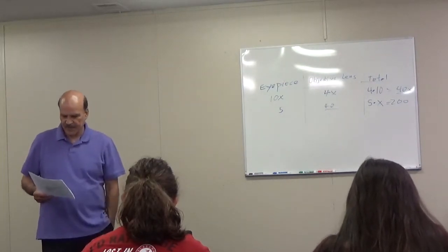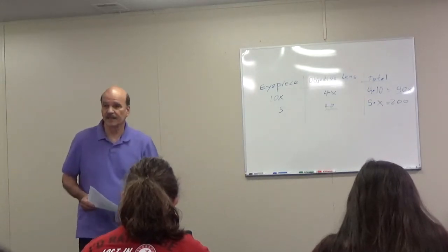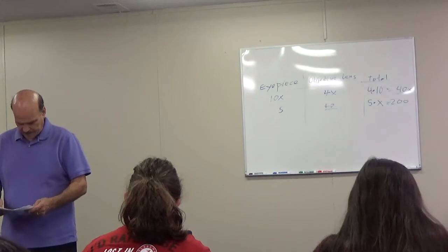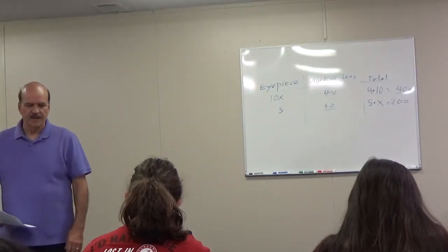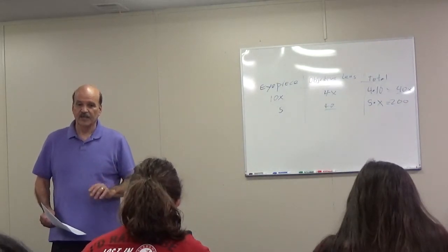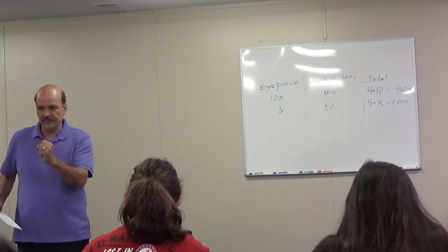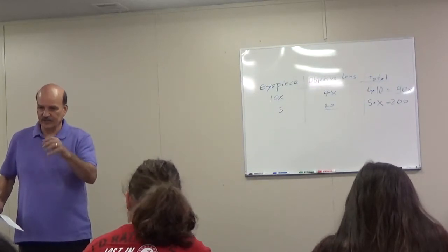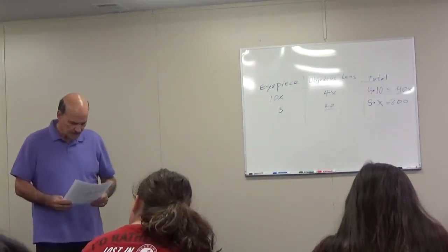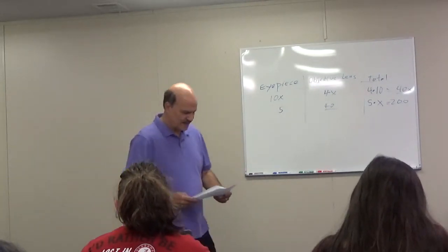And then on the back side, any questions on questions 5 through 8? Yes. This goes to the question about storing the microscope. Should we also lower the stage before we store it? Oh, I see what you're saying. No, you don't need to worry about that, I think. Because you're always going to start off using the lowest power and focus it there to make sure you have what you're looking at in the center of the field of view, so that when you go to a higher power, it'll still be within the frame of view, if that makes sense. But don't take it apart, please, to thoroughly clean. Let's not do that.